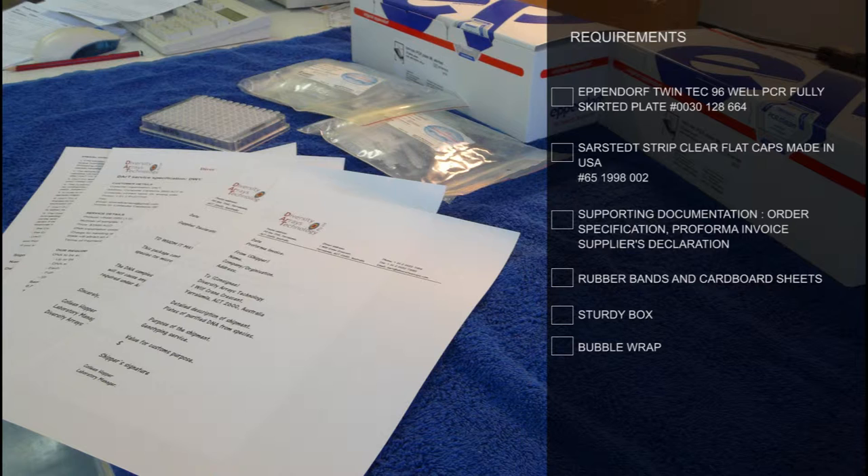The correct requirements that you will need are: Eppendorf twin.tec 96 well PCR Fully Skirted Plate, catalogue number 0030128664; Sarstedt 8 strip clear flat caps made in the USA, catalogue number 65.1998.002; supporting documentation which includes order specification, pro forma invoice, and the supplier's declaration; several rubber bands and cardboard sheets; a very sturdy box and bubble wrap.